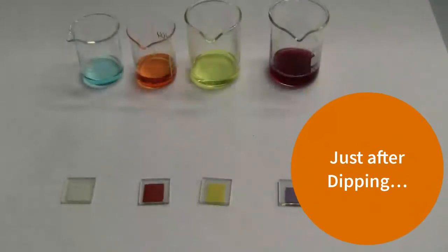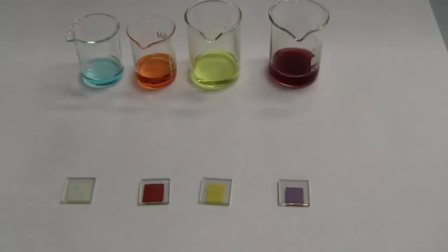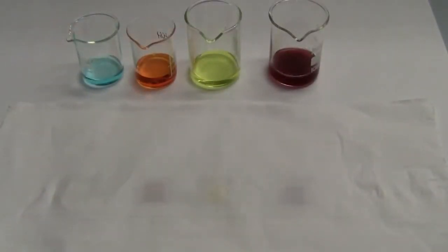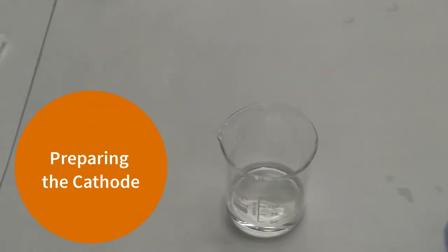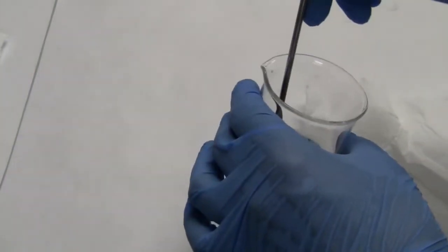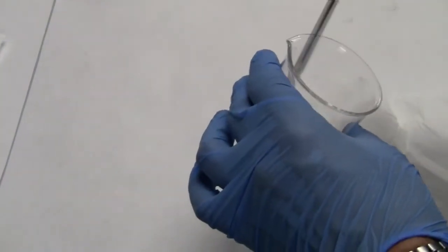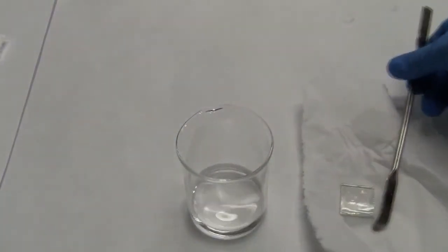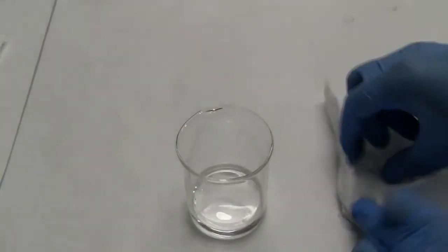At last, these are all our dyed glasses. The light blue dye was so diluted that in practice it did not dye our glass very much. The glasses are finally covered to protect them from light. The glasses we saved during the deposition of titania can be recovered and washed again in ethanol to prepare the electrodes, the counter electrode, by covering it with carbon.